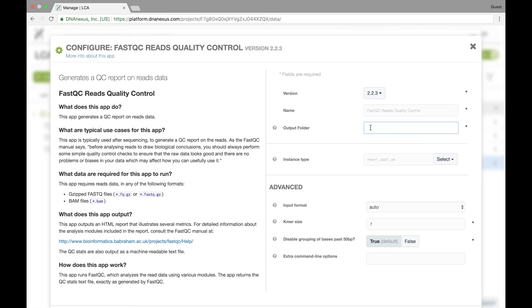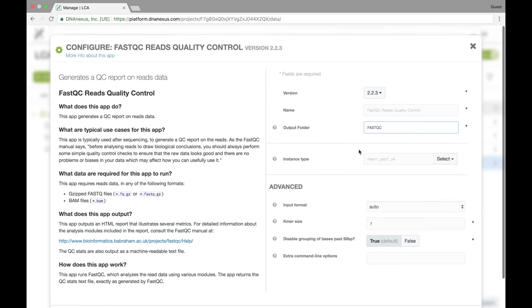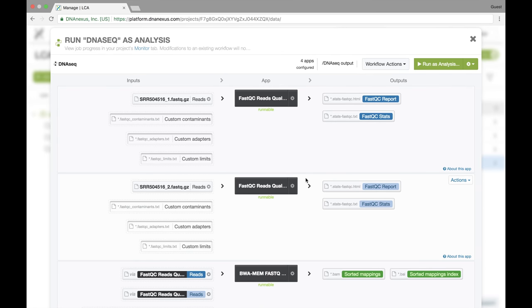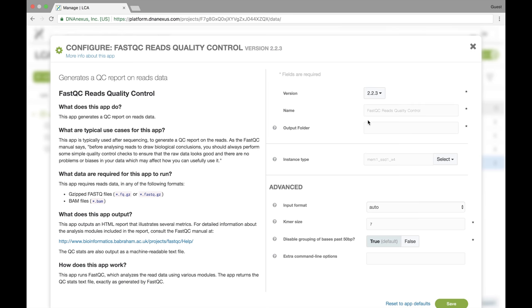In this case, I want FastQC to output to FastQC. I save that and I'll go and I'll set those options for each stage. Again, FastQC outputs to FastQC.